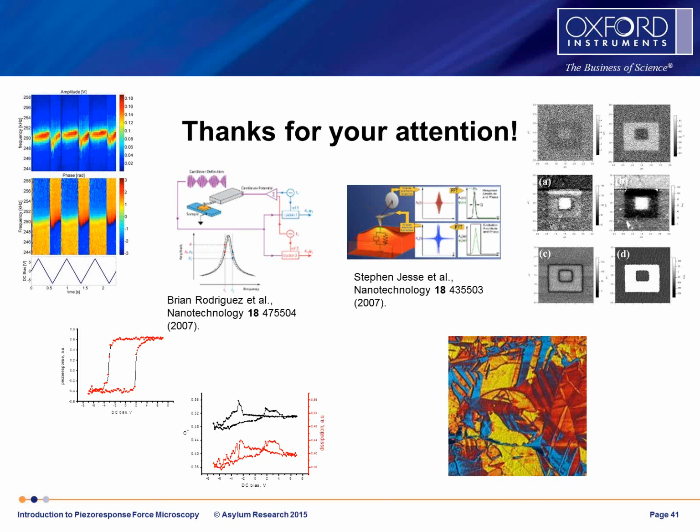And it turns out that at high frequencies it is still the case because aqueous solutions have ionic conductivity, which means that at low frequencies of order of hertz and tens of hertz, we will have electrochemical reactions. At high frequencies, the ions are simply not fast enough to respond to the electrical bias applied to the probe.